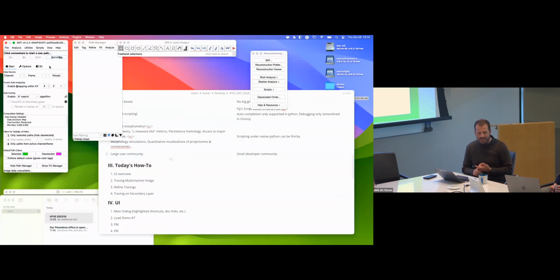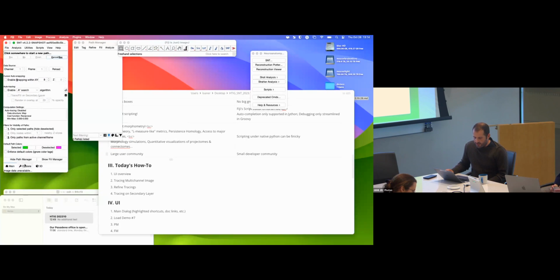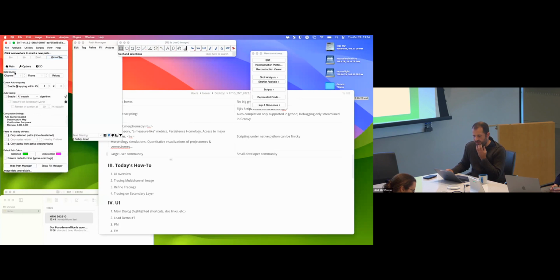There's a library out there called FlatLaf that keeps patching all the bugs that Swing has that have not been updated in many years, and they add scalable icons, SVG icons, and all sorts of stuff. That's what we are using here. This part is now part of Fiji, and out of the box you get customizations, you can move things around. That has not always been a tradition in Fiji, but we try to make things user friendly.